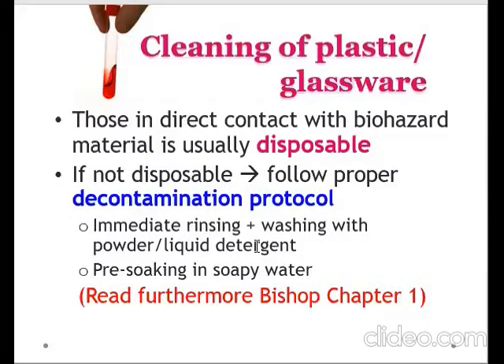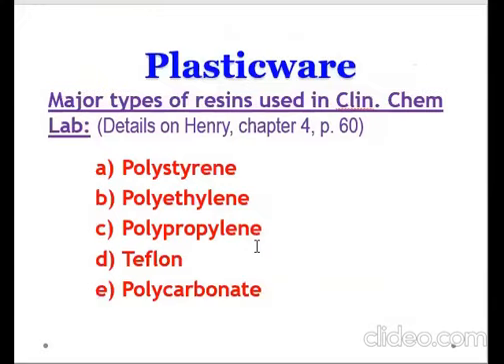Okay, also, before we proceed to the next slide, I would also like to tell you that when we are performing decontamination, you need to make sure that the detergents and the temperature levels that you're using are compatible with the material that you are cleaning, and it is based on the manufacturer's recommendations. Okay? So now let us proceed into discussing the major types of plastics or resins used in the clinical chemistry laboratory.